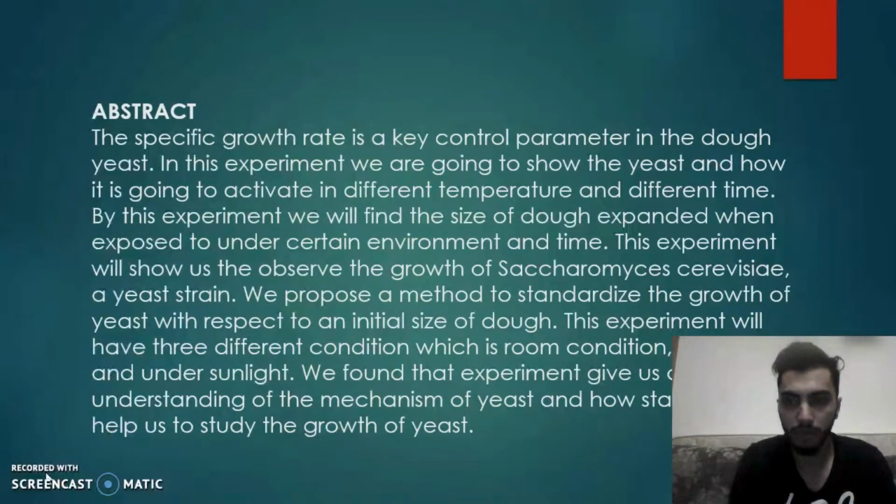This experiment will have three different conditions, which is room condition, dark room, and under sunlight. We find that the experiment gives us deep understanding of the mechanism of the yeast and how statistics data help us to study the growth of the yeast.